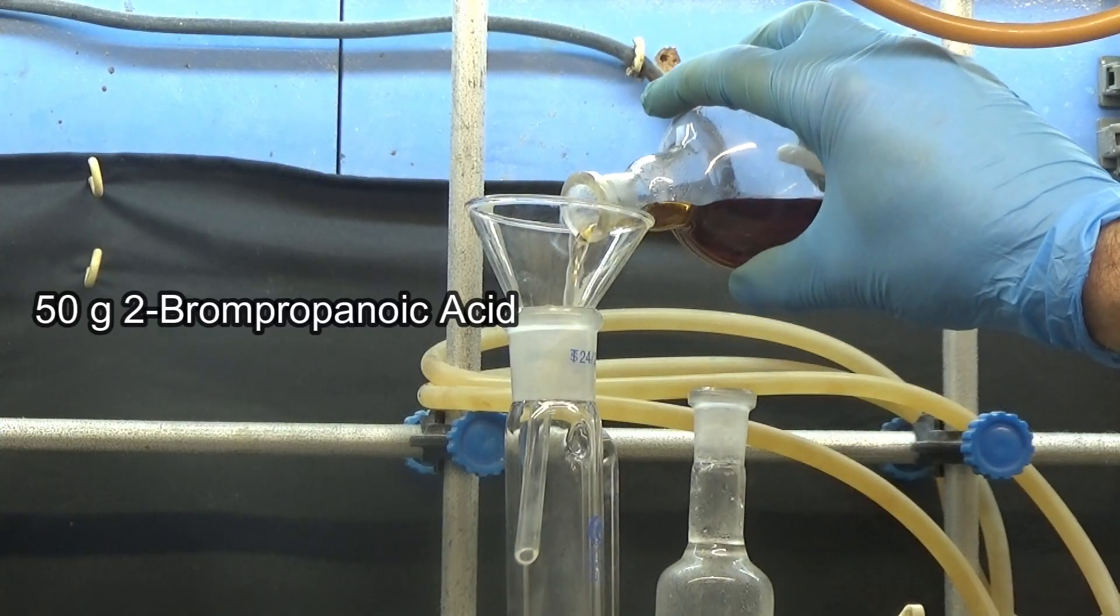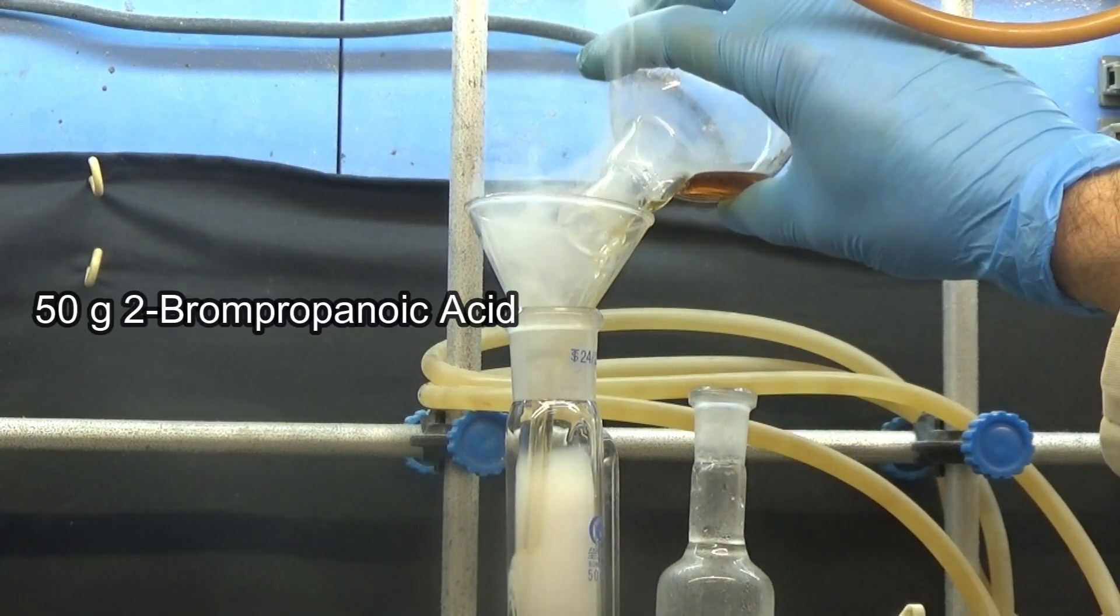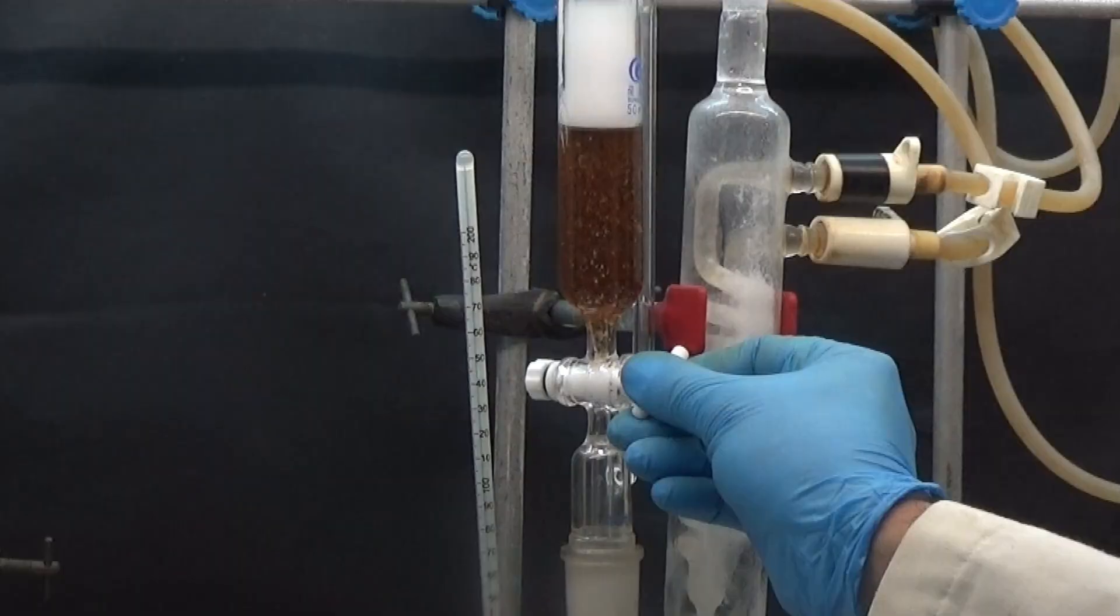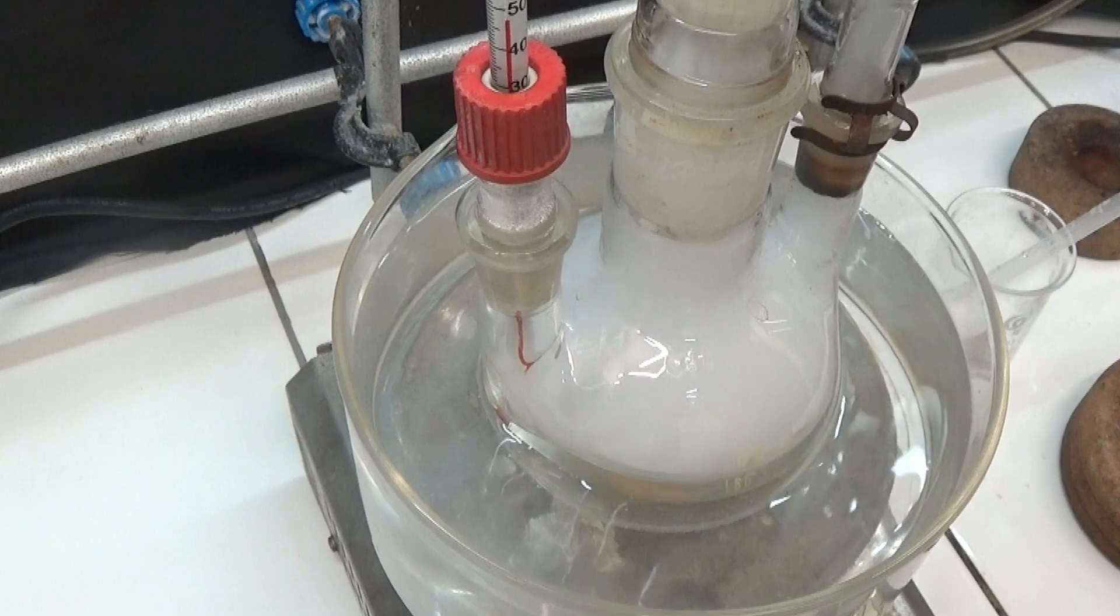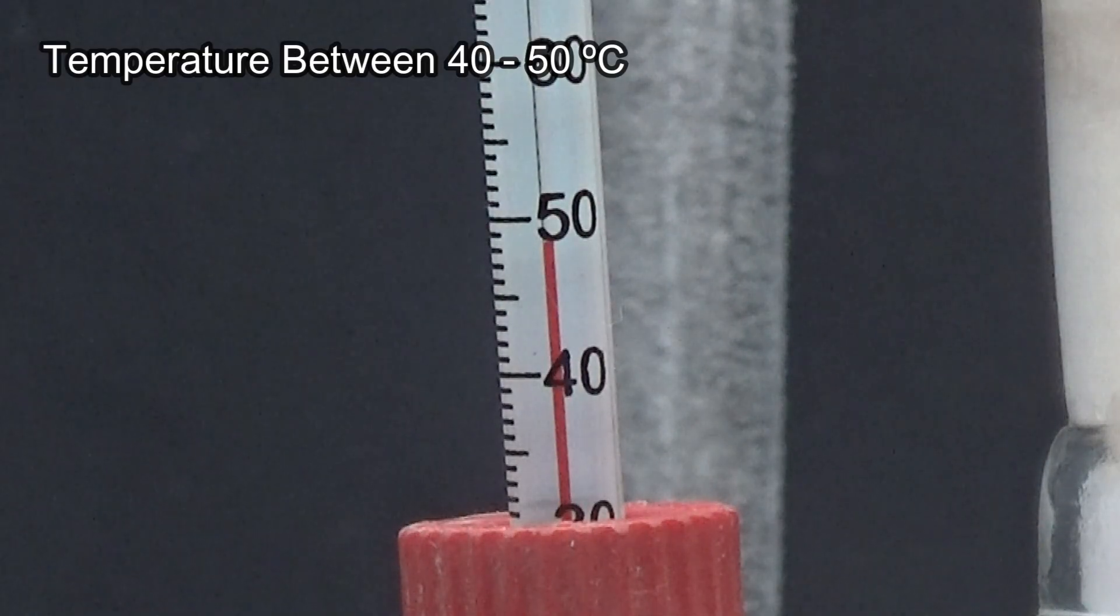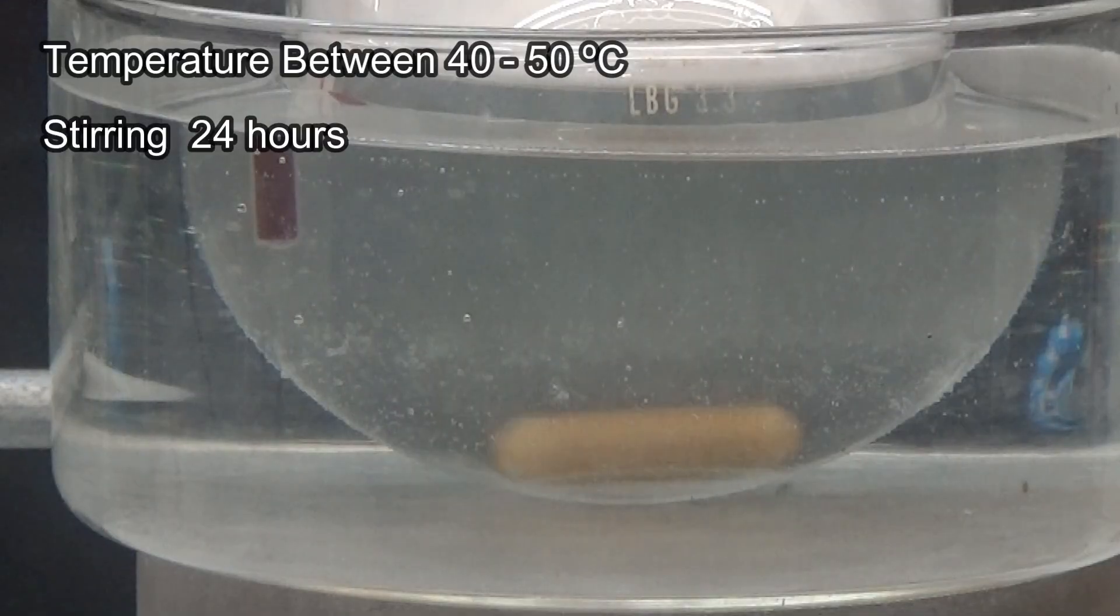Once all the ammonia has been added, put 50 grams of 2-bromopropanoic acid in the funnel. Slowly add the acid with stirring and maintain the temperature between 40 and 50 degrees. Leave stirring for 24 hours.